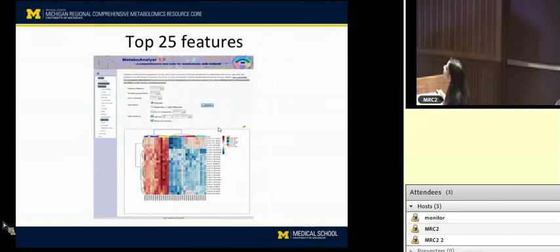Yeah. So there is also, yeah, I saw that there is a detailed view, and that's for less than 2,000 features we can see. Yep.